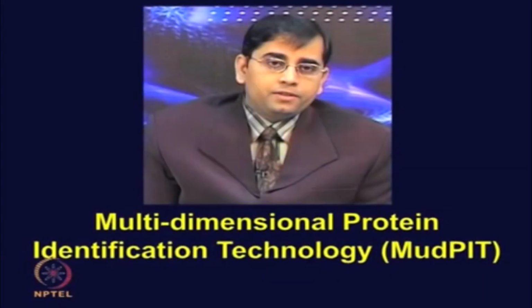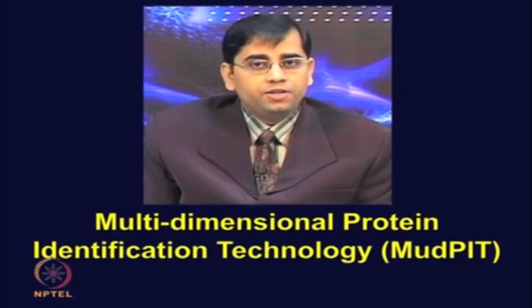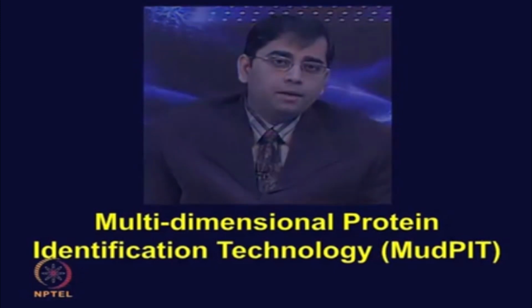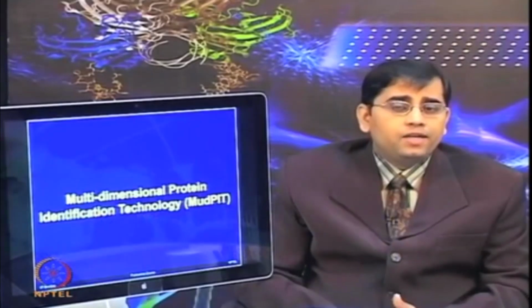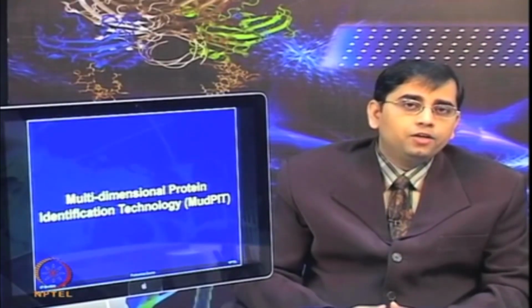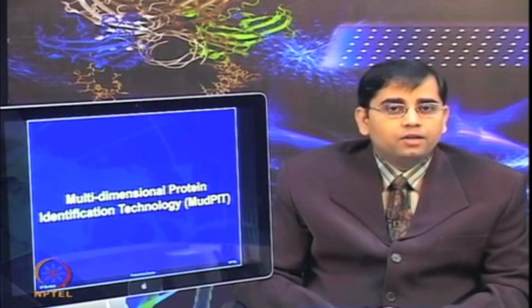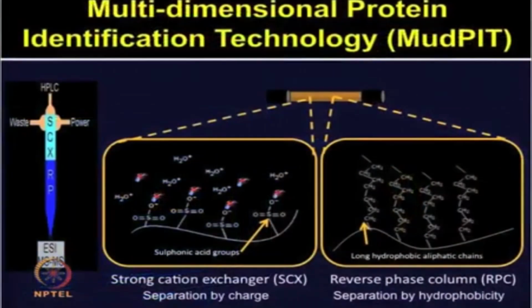So, what is MudPIT, or multi-dimensional protein identification technology? The MudPIT method combines cation exchange and reverse phase HPLC chromatographic separation of tryptic peptides for proteome-based analysis. We have already discussed the two separate methods, SCX and RP.